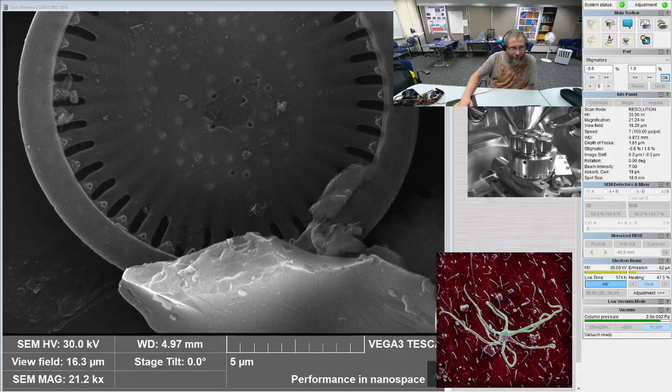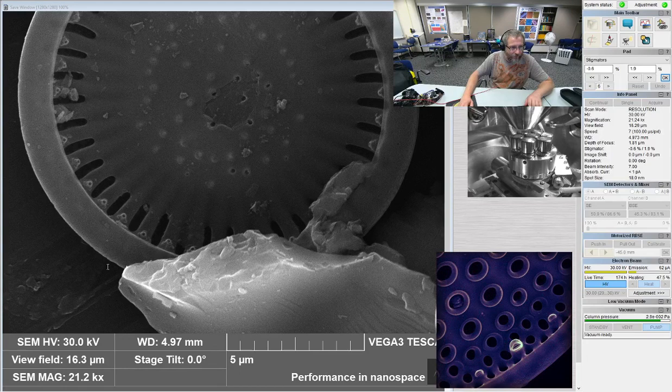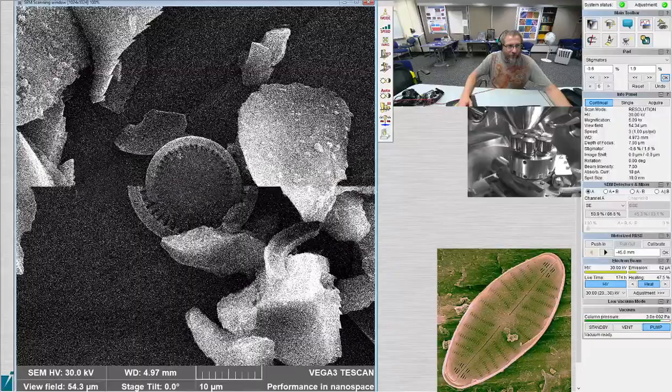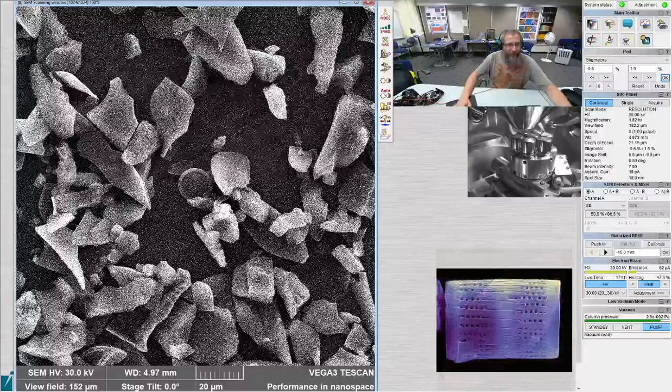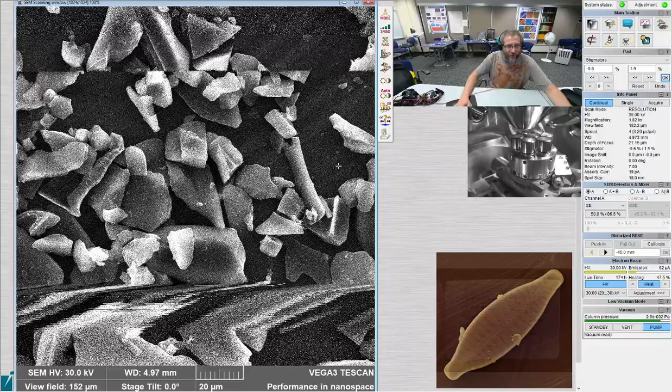So we get stuck in this loop of things that don't quite work perfectly. It could be Phasaenorbis, though. I'll just call them cycloteloids for now. Well, how strict is Phasaenorbis about having a fultiportula on every costa? Yeah. It's important that we follow the rules that I laid down for what Phasaenorbis is. Whatever those are. But I think this is part of what, when Mark and I were looking at the rest of these things that were kind of similar to Phasaenorbis, trying to figure out whether they actually belong there or not.